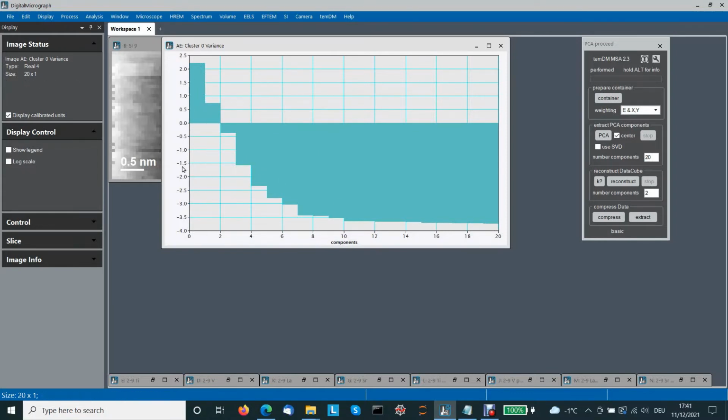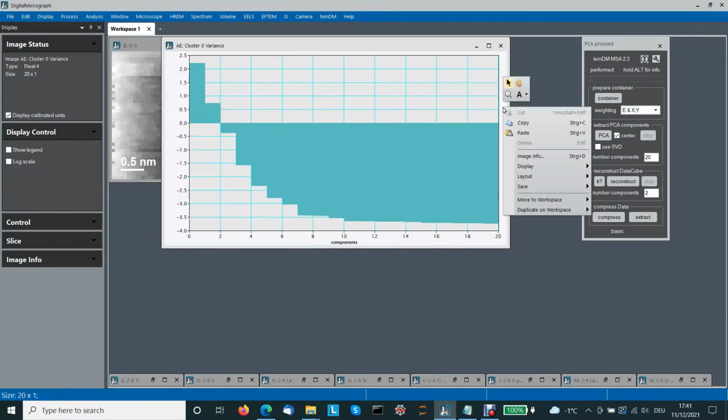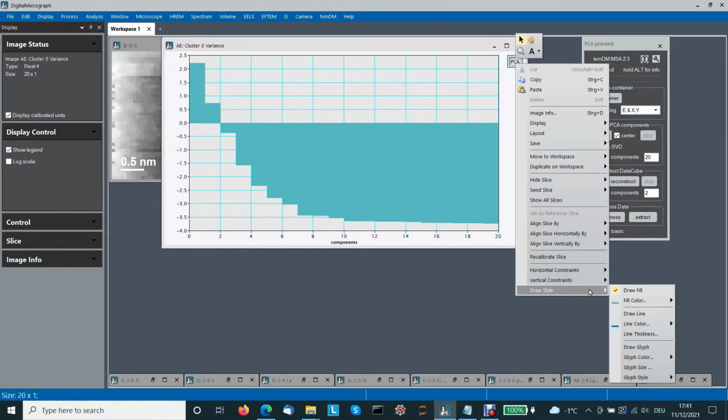It actually shows not the variance, but the logarithm of variance. So it might be negative for some. It might be confusing, but we can show that in another form.